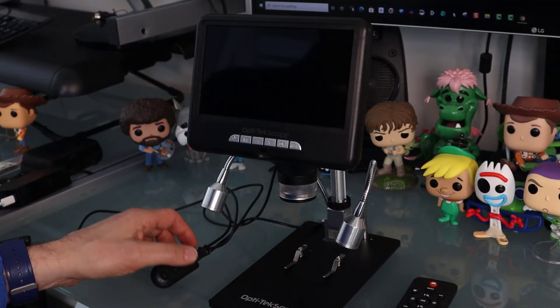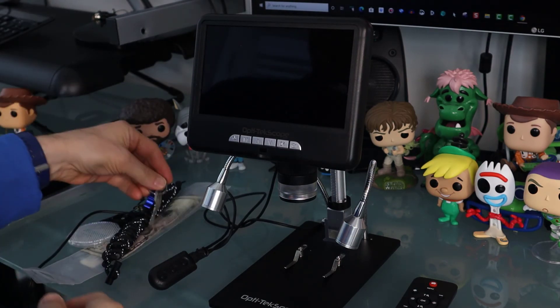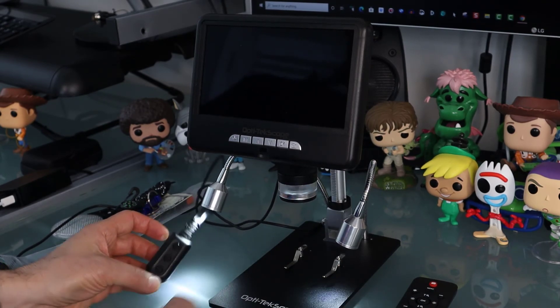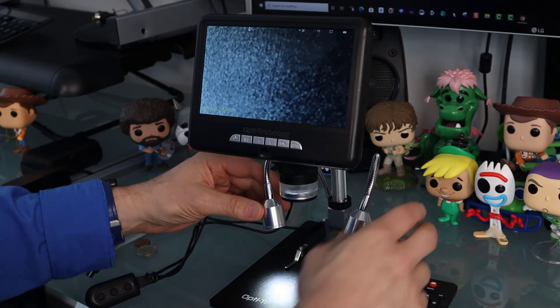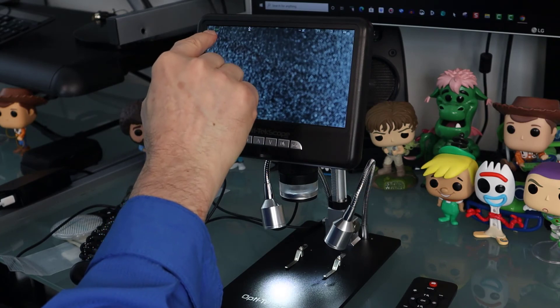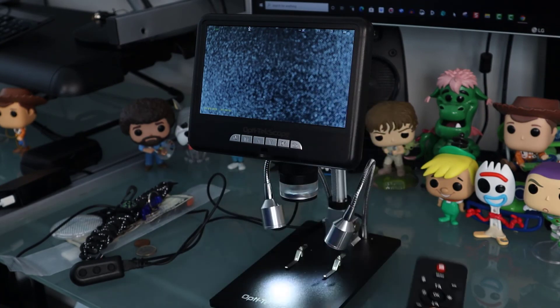Let's go ahead and dive in. I've got some money, a reflector piece, a safety bracelet for hiking, a key, and some change. Right here you have where you can turn it on and adjust your brightness level. The LED lights are nice and bright, and you can adjust where you want those to go. Up here you've got your power button, menu function, up and down arrows, camera button, and then your screen. If you're recording, you'll see it says standby and record. You can control a lot from the remote control if you choose.